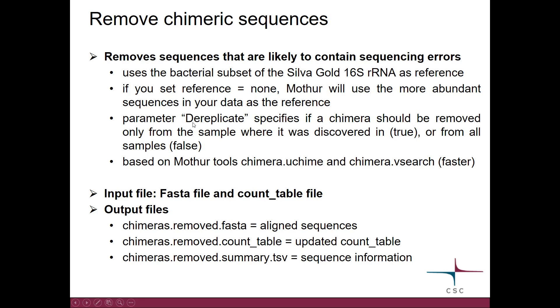One of the parameters specifies if a chimera should be removed only from the sample where it was discovered or from all the samples. This tool in Chipster is based on the Mothur tools chimera.uchime and chimera.vsearch. The vsearch option is faster, so we recommend that you use that.